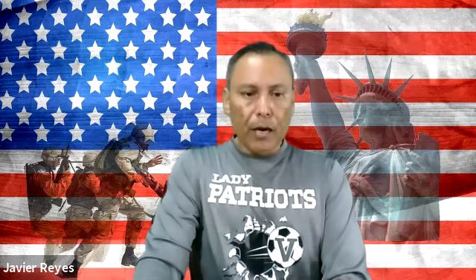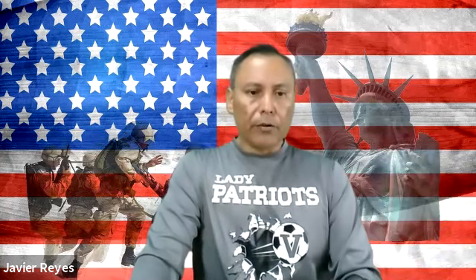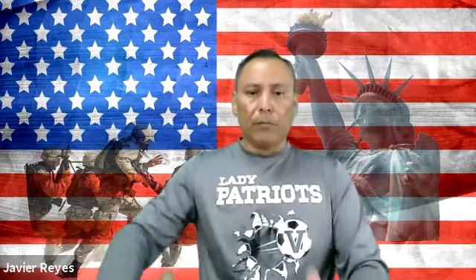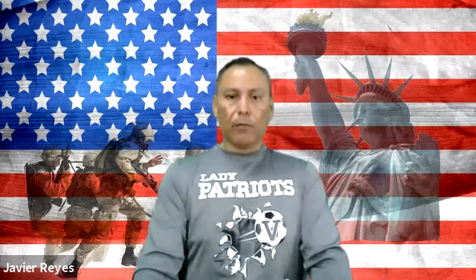So let's say you work in a mobile lab. How do they carry their specimens? There's some rules that they have to follow as far as carrying the specimens. So you have all your specimens, bringing them back from wherever you were at, bringing them back to your lab. Now you have to put them in a container. Okay, there's certain measures that you have to follow. The transport box, right? You're going to put them in the transport box. This must be closed to avoid any spills, obviously.